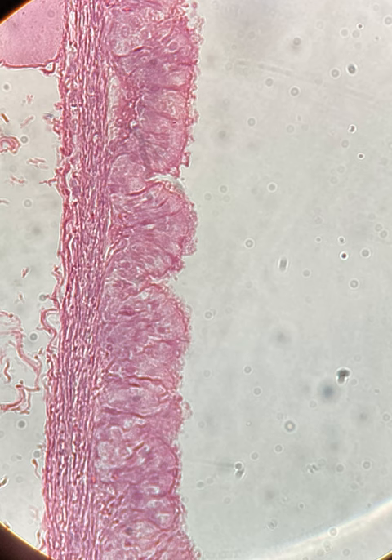If they're secreted and sort of pushed away. One thing that you will often see embedded next to or within these cells are called goblet cells, and they actually produce mucus, and then these cilia would move the mucus along.